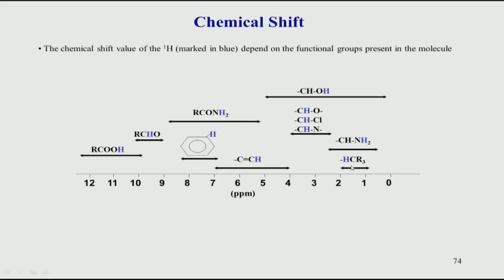Typically, methyls or CH3 groups are always upfield shifted, to somewhere between 0 to 2. Methyl peaks are very dominant and prominent in NMR spectroscopy. They can be very easily recognized because they always come somewhere between 0 to 2.2, 2.5 ppm. So, the typical zone for methyl peaks is here, and in the different analyses we will see why they come here and how they can be used.